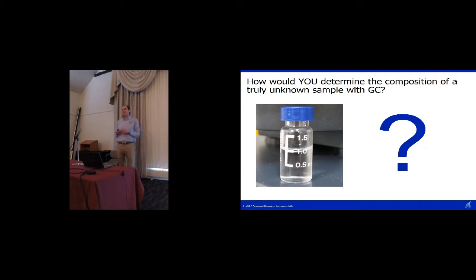You're all chromatographers, so I know somebody knows the answer to this question. It's spiked with internal standards and run by GCMS. Okay, GCMS, and you'd find out all of the different components in the sample, okay? What would you do next? So if I asked you how much of each component in there, what would be the next step? We use the internal standards to do an estimate.